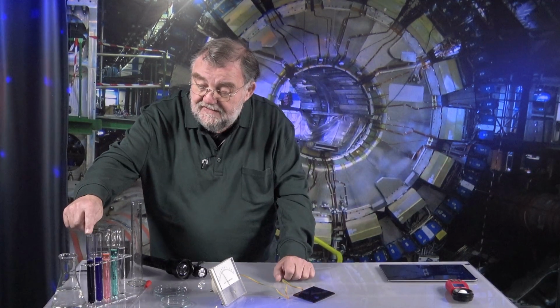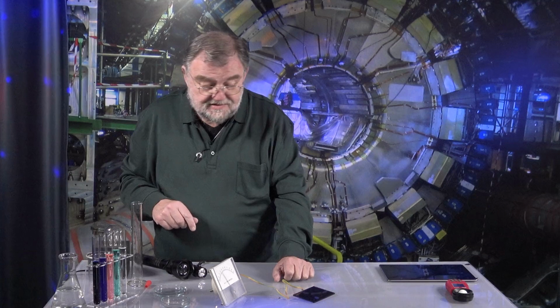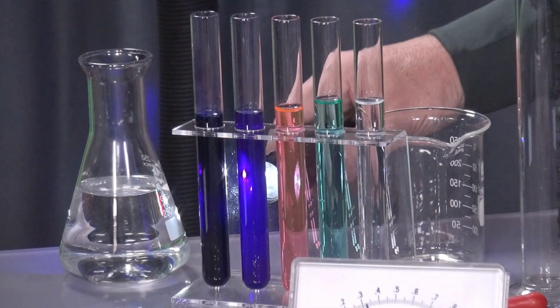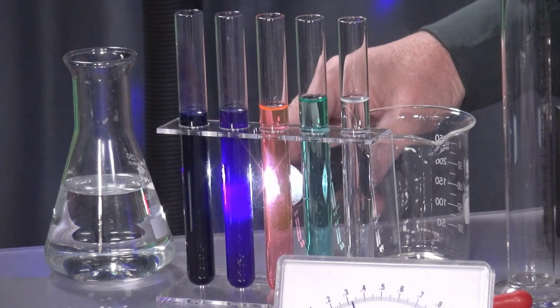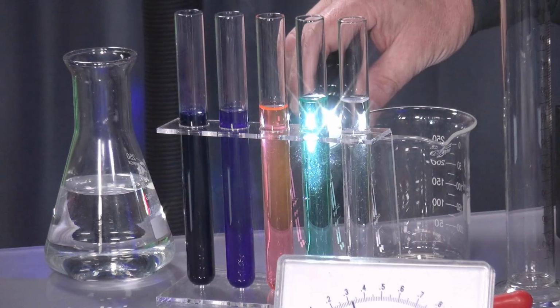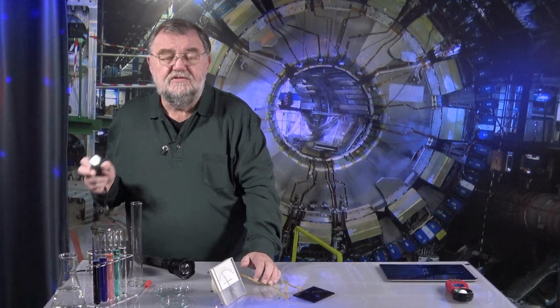Then I can look at how transparent my fluid is. I have brought here, so to say, a battery. We'll take a small lamp and have a look. When I shine it, so good as nothing comes through. It is pretty dark here, it is light blue, there is little redness. So I'll go a bit away, and so green. And now the question is, and that is white, totally transparent. So now we are back to estimating, okay, that is darker, that is lighter, not very accurate.